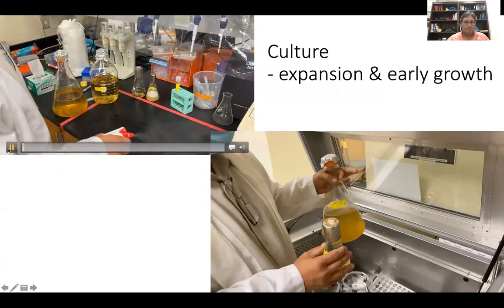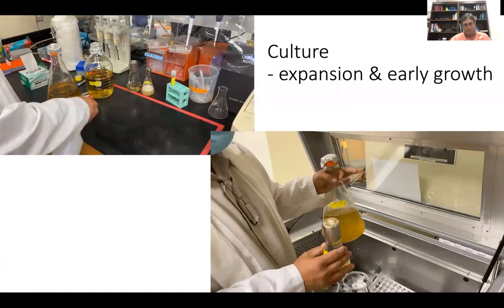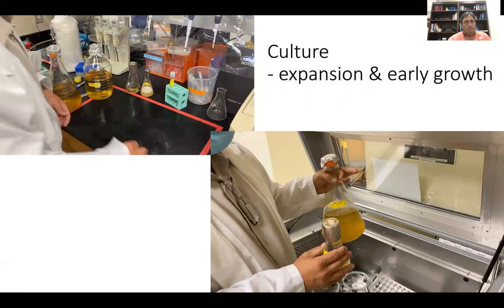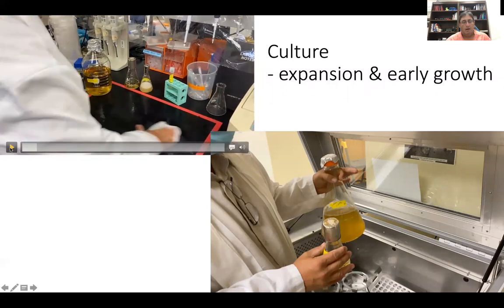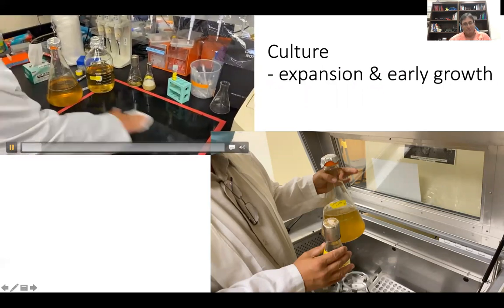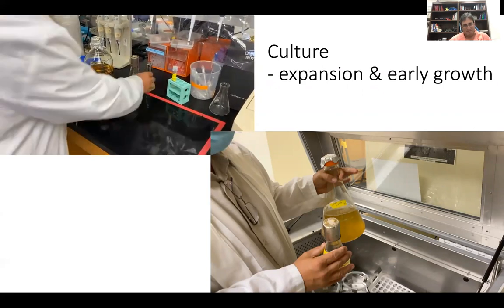All right, so we've let those go overnight, and now we're going to transfer them, or inoculate, expand the culture, so then we can let it grow and then induce. He should be wearing gloves, but he is wiping his hands with ethanol in between. Again, we'll clean up our work area.